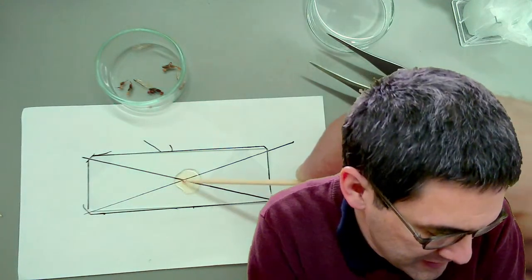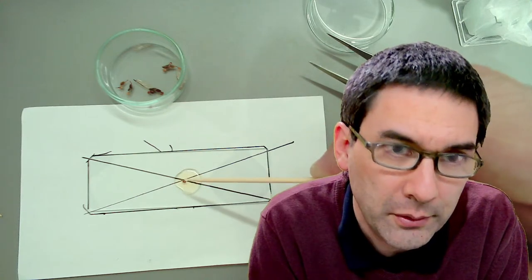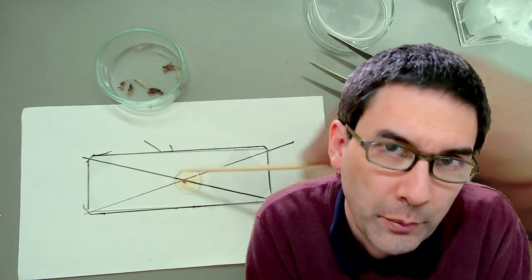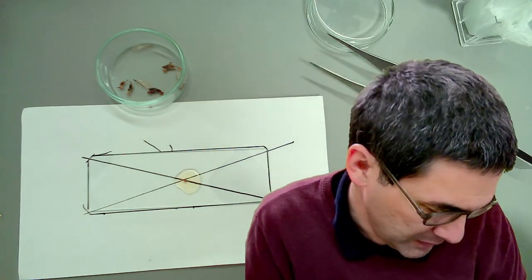Sometimes for larger specimens, what I do is I simply put another drop on top. So I make the first drop very small. Then I put a larger one on top. Okay. This might sometimes also work.